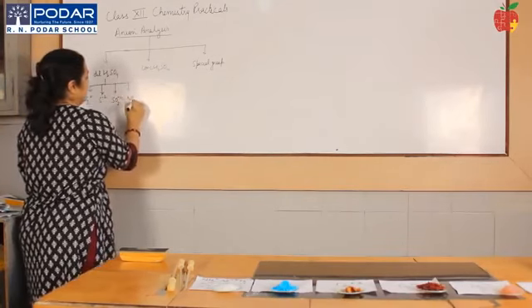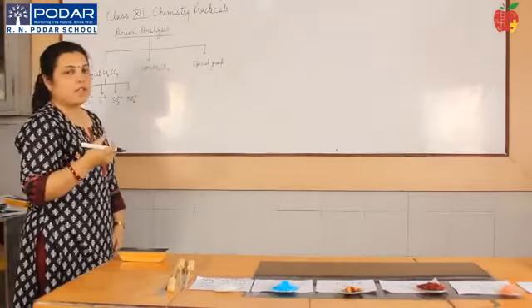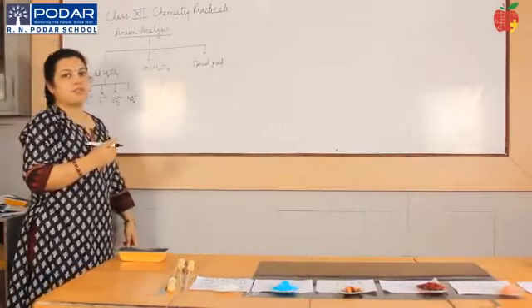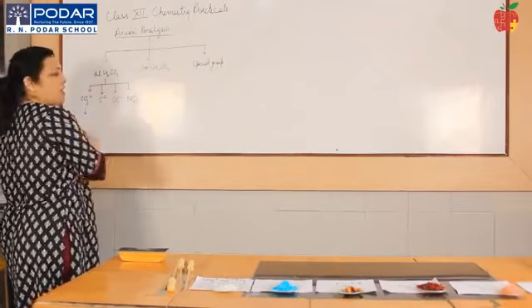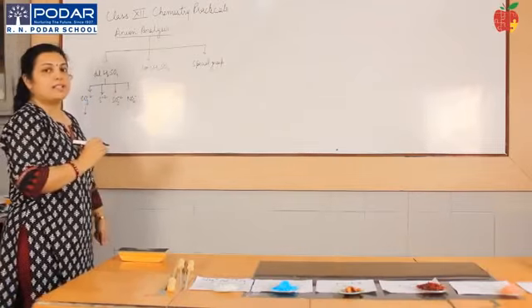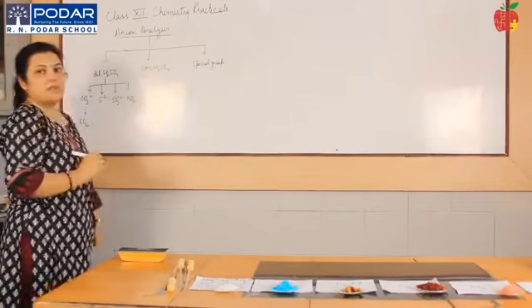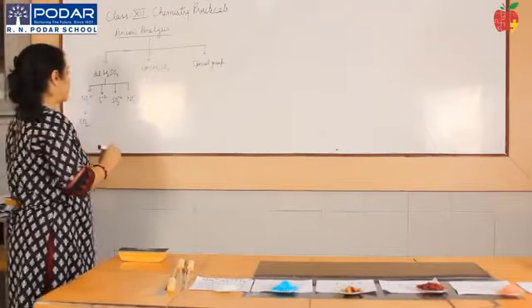and your nitrite. Now when we add, we take a pinch of salt. Now the way you proceed is you take a pinch of salt in a test tube and then you add dilute H2SO4. Now if you observe a colorless, odorless gas coming out of the test tube which turns lime water milky, then you can assume that the gas which is given out is your carbon dioxide, which will basically tell you that the anion present is your carbonate.